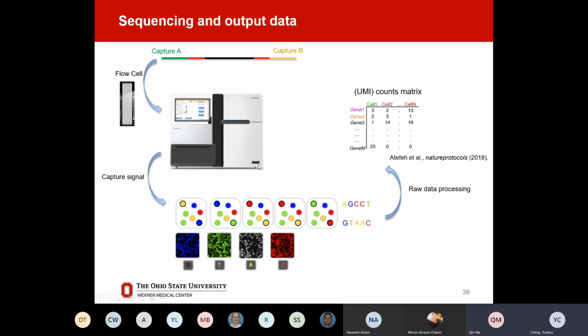I will have a comment regarding this question and answer. The error rate is definitely very important, and directly determines how the data plays a role in the downstream analysis. But this part is mostly taken care of by the sequencing center or sequencing company. They keep developing advanced technology to decrease the error rate.